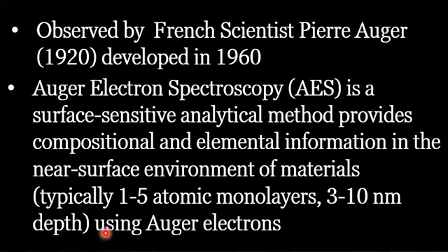So this means that Auger electron spectroscopy is limited to a certain depth. The average depth from which an Auger electron from the surface may be ejected is around 5 nanometer. However, the depth of emission of Auger electrons varies from material to material, and it is in the range of 3 to 10 nanometer as a whole.